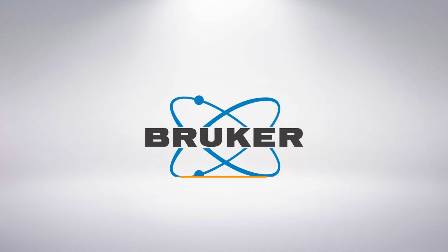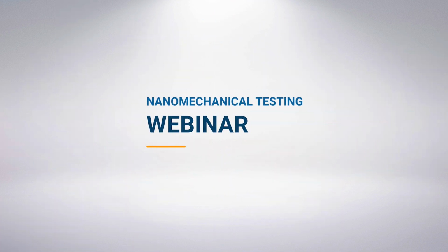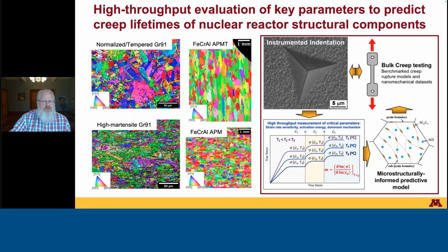We're trying to get the key parameters that will allow us to predict creep lifetimes of these nuclear reactor steels using indentation. We're going to look at 4 different materials today. 2 of them are based on this grade 91 type of alloy, which is a ferritic martensitic steel. There are 2 different states that we're going to look at it in.